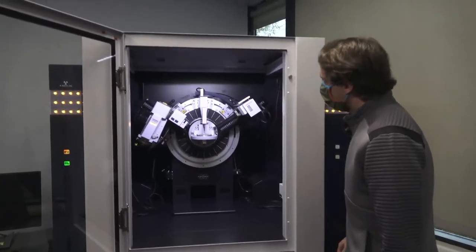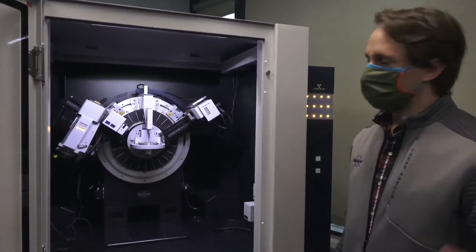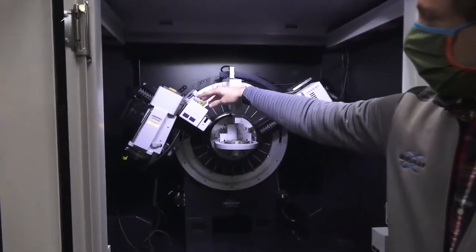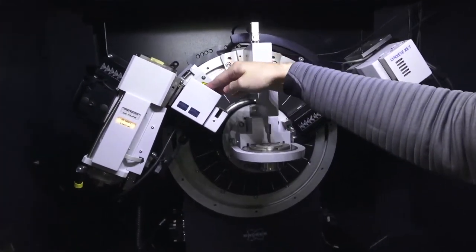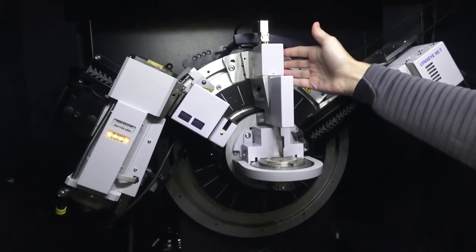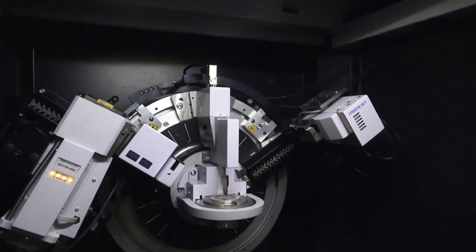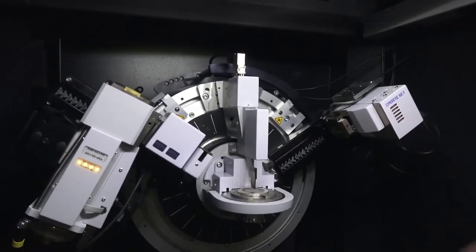Yep. And if we look at the components, we'll see all the same ones that we saw in the studio. So on our primary side here, of course, we have our tube. And then right in front of that, we have our motorized slits. This is one of the components we'll be using for DBO. Right over our sample, of course, you can see our mask, our motorized air scatter screen. So as we're scanning, this screen will automatically move up and down. And then on the secondary side, we see our Lynxeye XET detector.